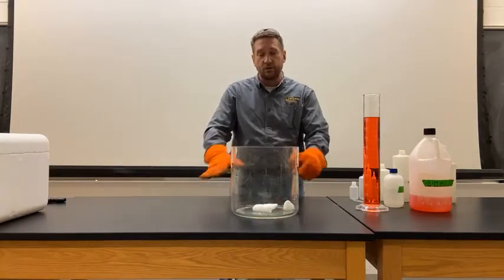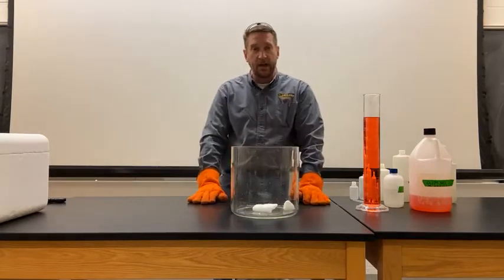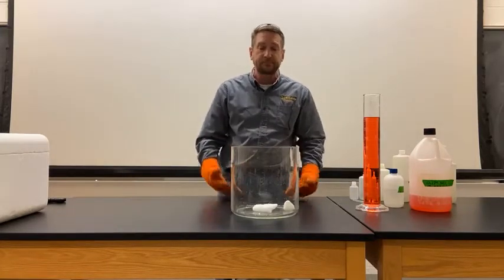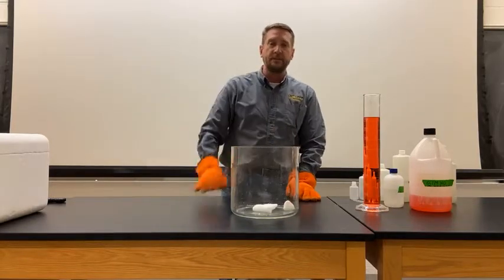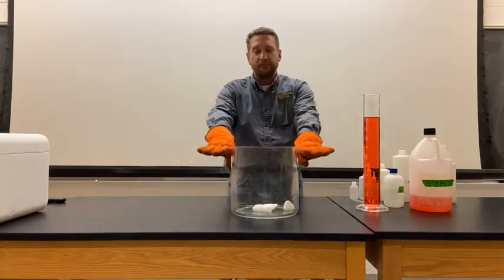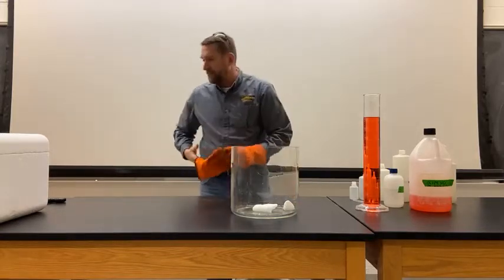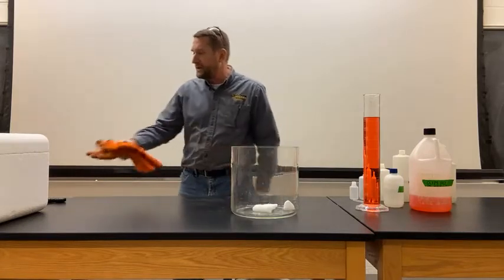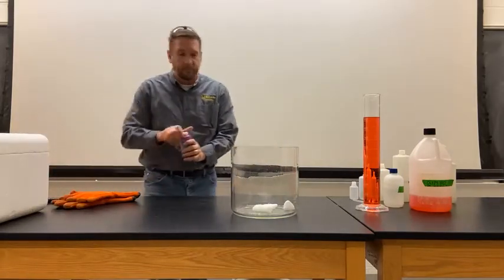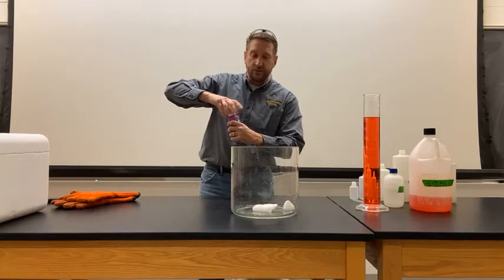And so what's going to happen here as the carbon dioxide sublimes is that it's going to force the air out of this container and basically be filled with carbon dioxide. So we can do a couple things to demonstrate that it's filled with CO2.